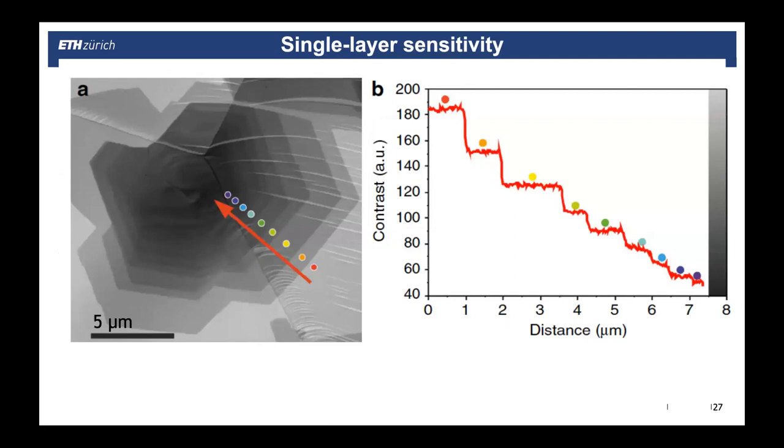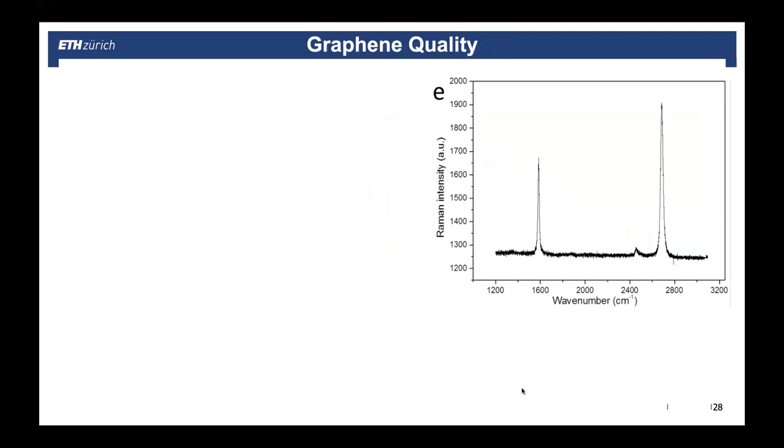So at 1000 degrees, looking in a scanning electron microscope where secondary electrons are detected, we see the different contrast levels. This is already the first level of graphene here. Then 1, 2, 3, 4, 5, 6, 7, 8. Up here it is a bit difficult, but we can detect really several layers of graphene. So I thought this is quite fantastic. And then you have a good tool to grow, experiment and study all this. Now we'll just quickly go through that.